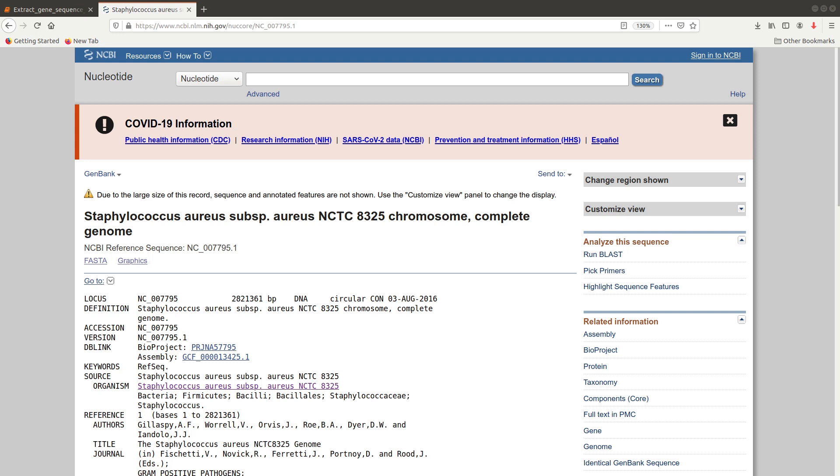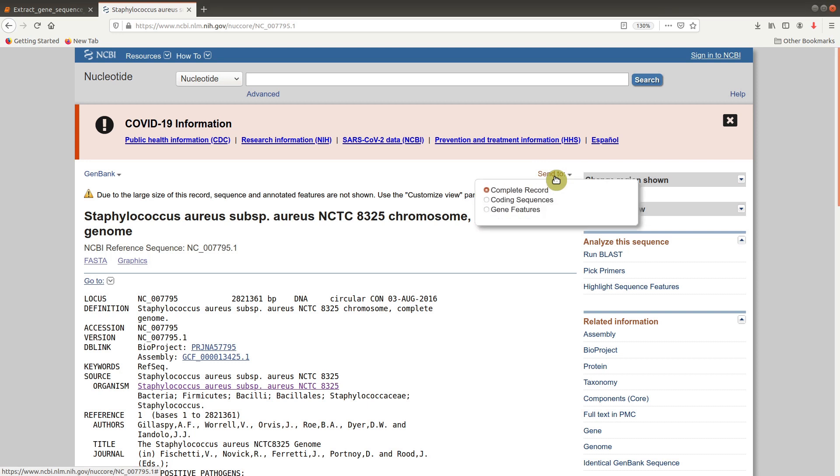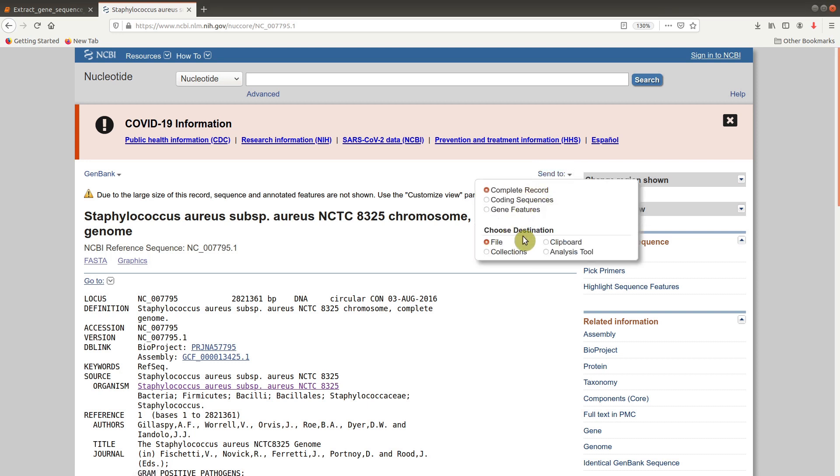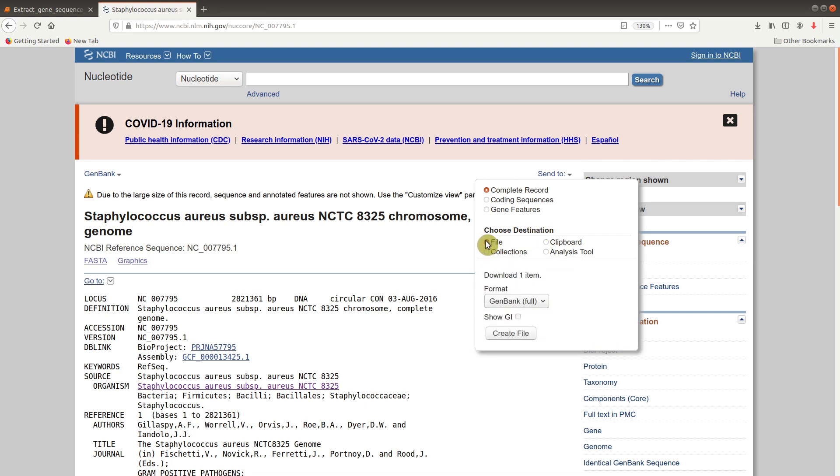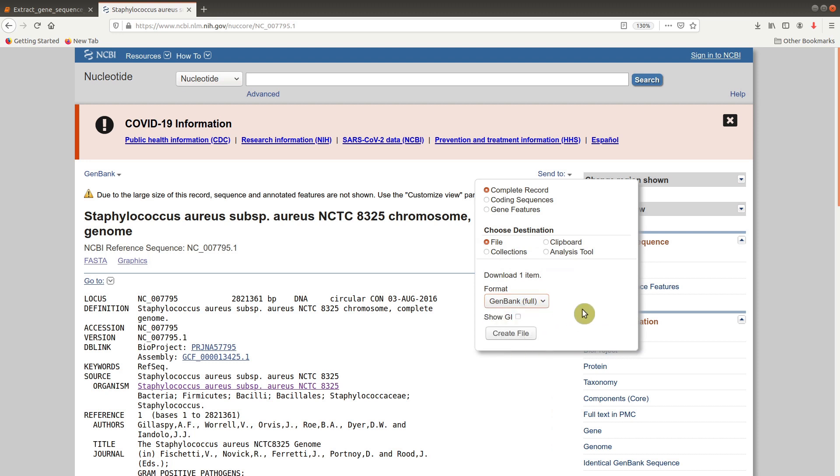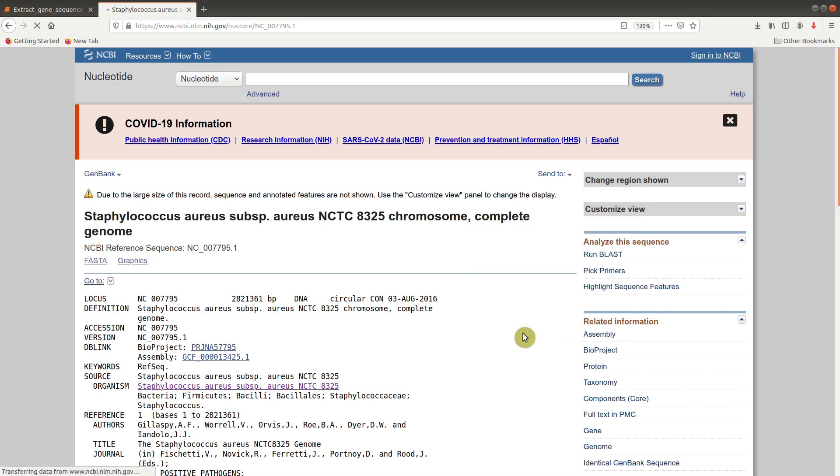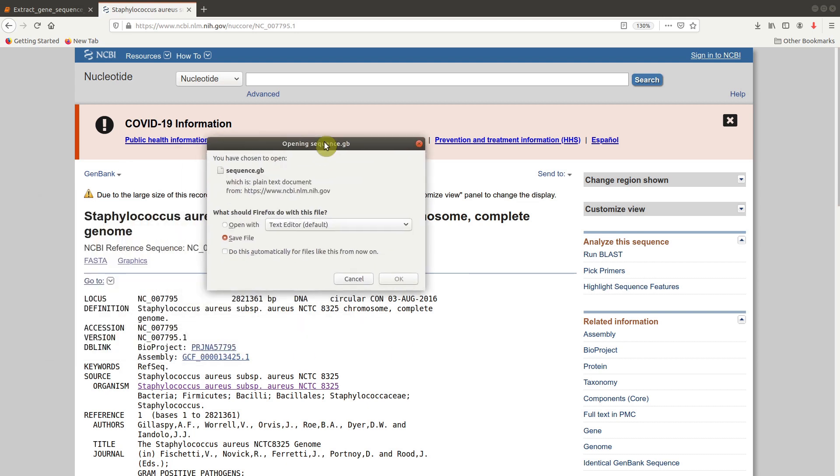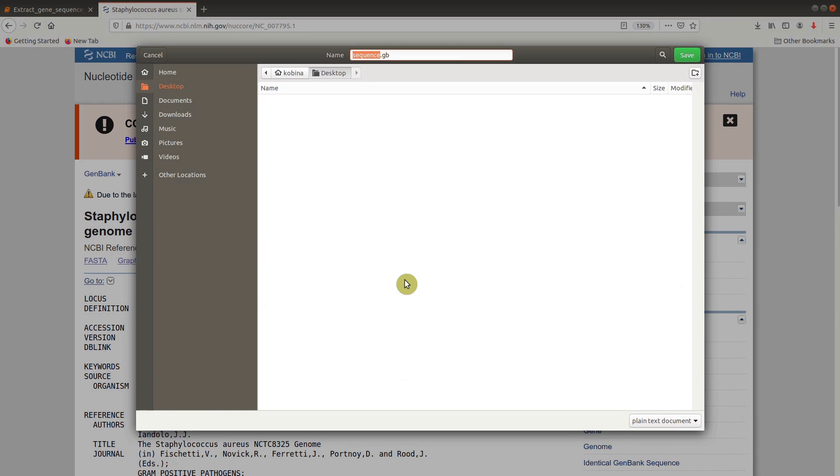To download it, first go to Send To which is here. Click on it. Make sure complete record is checked. When you come to destination, make sure file is checked. And when you come to format, select GenBank. Then click Create File. You'll be asked to download, and save it where you want. For my case, I'm saving it on the desktop with the default name.